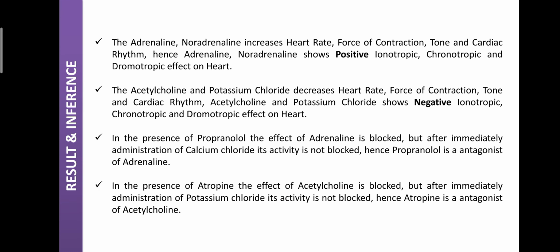Regarding result and inference from this experiment, the first result and inference is that adrenaline and noradrenaline increase heart rate, force of contraction, tone, and cardiac rhythm. Hence, adrenaline and noradrenaline show positive inotropic, chronotropic, and dromotropic effects on the heart. Due to these properties, they are helpful for the treatment of heart failure or congestive heart failure, where the heart rate decreases more than normal or the heart fails to pump.